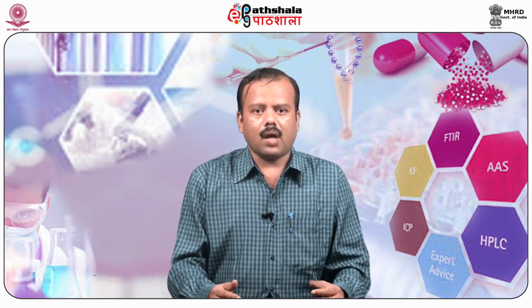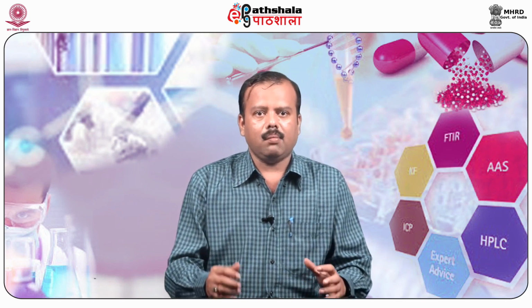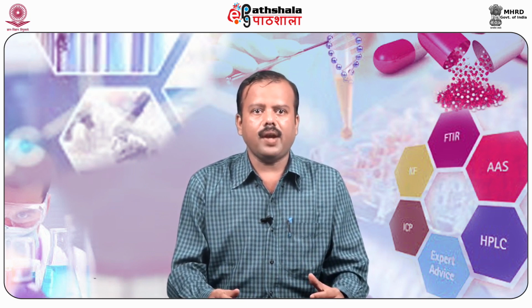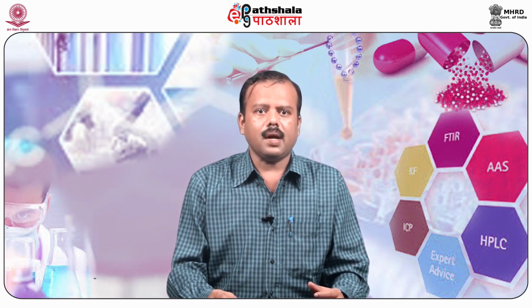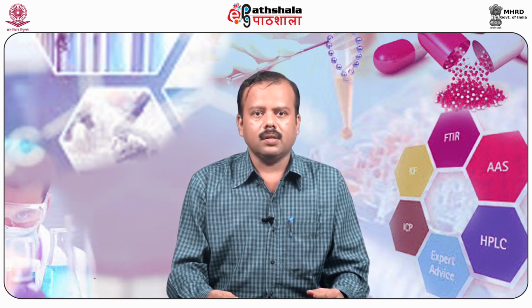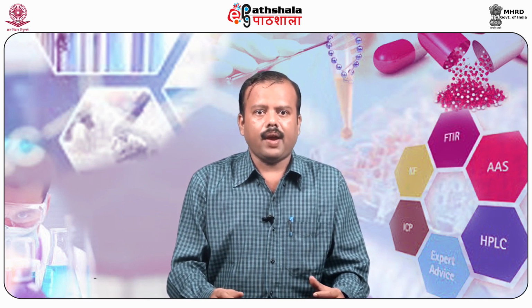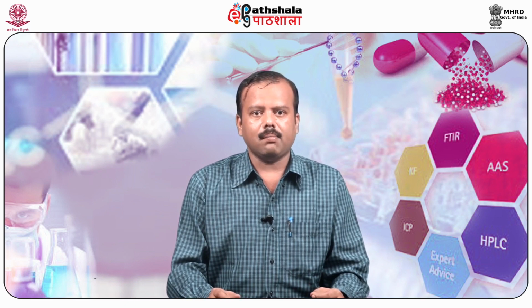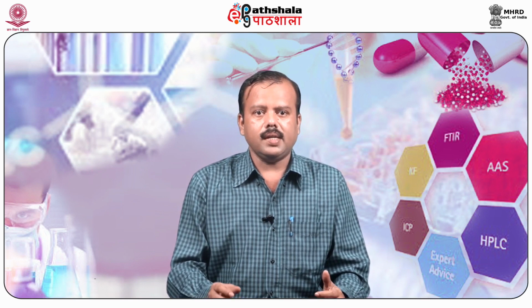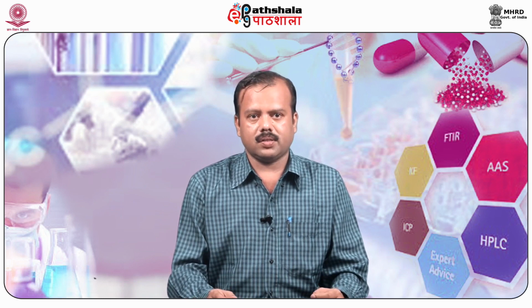Sometimes the microbial growth is also analyzed by visual inspection. Why is microbiological evaluation of antimicrobials important? Number 1, to estimate the potency of the antimicrobials. The difference in the activity of an active and inactive form of a chemical can be determined only by biological assay. The activity of the preparation is compared to the activity of a standard preparation.